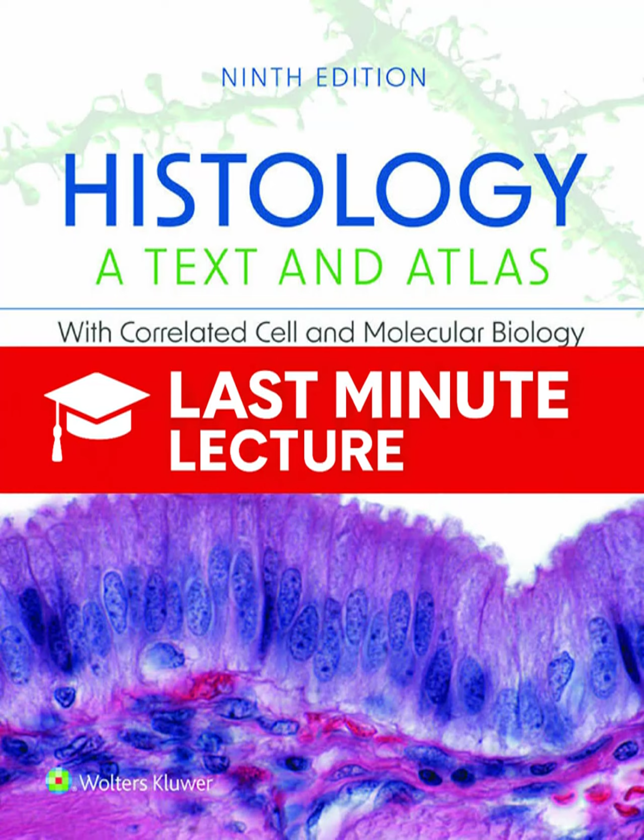And we also have the polarizing microscope for those really highly ordered crystalline structures. Right. This is a light microscope with two polarized filters. It's designed to detect birefringence, which is the ability of highly ordered molecular arrays to rotate the plane of polarized light. It's invaluable for identifying things like the contractile filaments in striated muscle or collagen fibers.